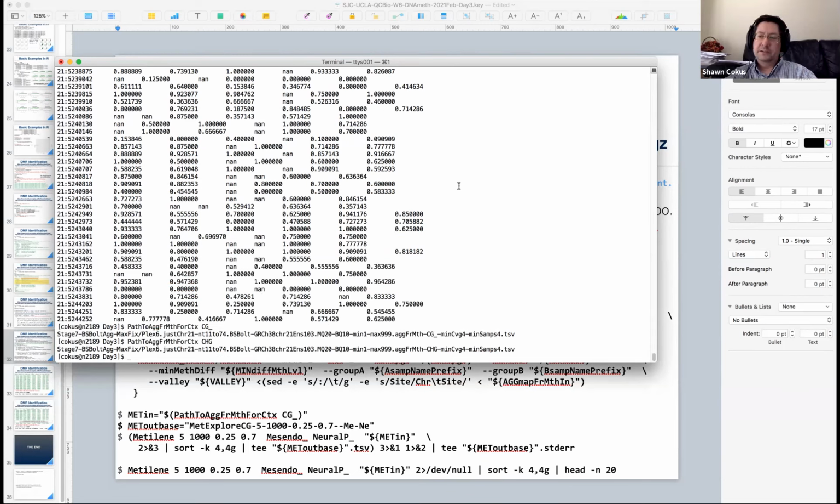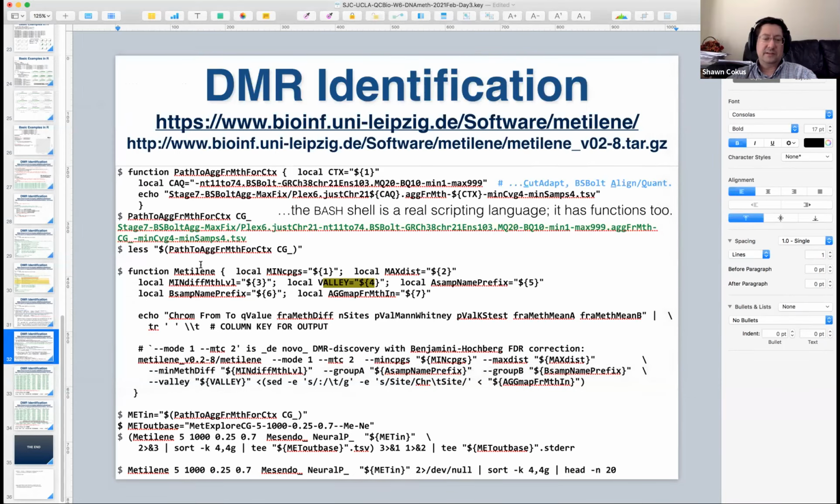But while we're in this exploratory mode, it'd be nicer to interact with things faster and be more rapid. We'll fixate it into files and so on at the end when we know what to do. But at the moment, we just want it to start generating some intervals. We'll check them out in IGV. And so we just want to play around a bit. We don't want to have all this junk on it. So this little function will allow us to run rapidly through Methylation permutations.